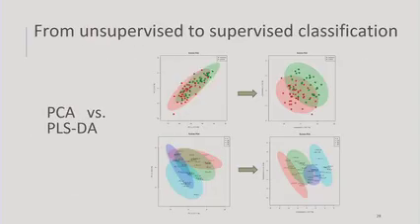All right, so another method in MetaboAnalyst that's available is PLSDA, which stands for partial least squares discriminant analysis. It produces plots that look very similar to principal component analysis, but they're calculated in a different way. You can see these are two data sets, one with 2 groups and one with 4. The principal component plot is the first one, and the PLSDA plot is the second, and we see much greater separation between our groups.